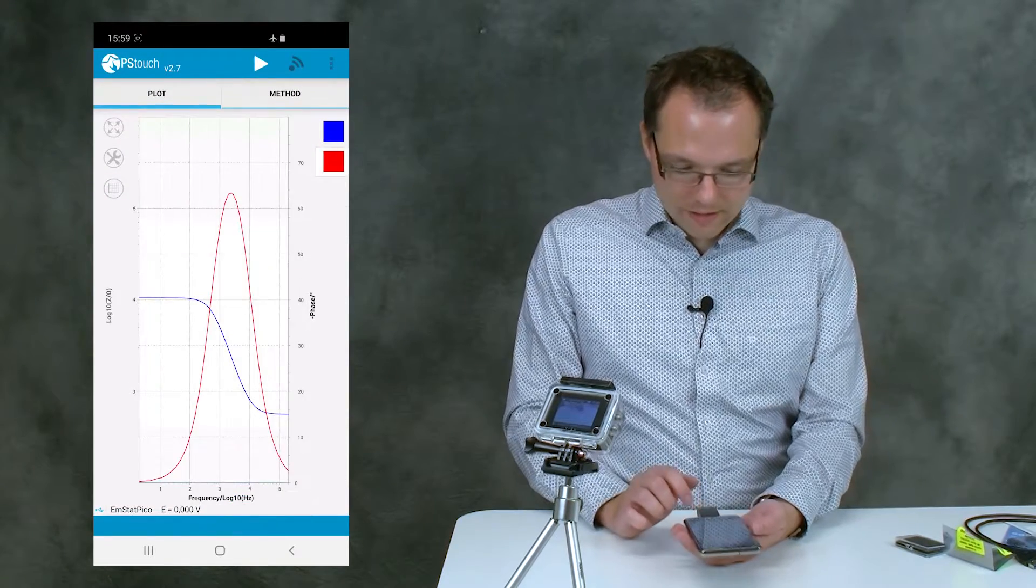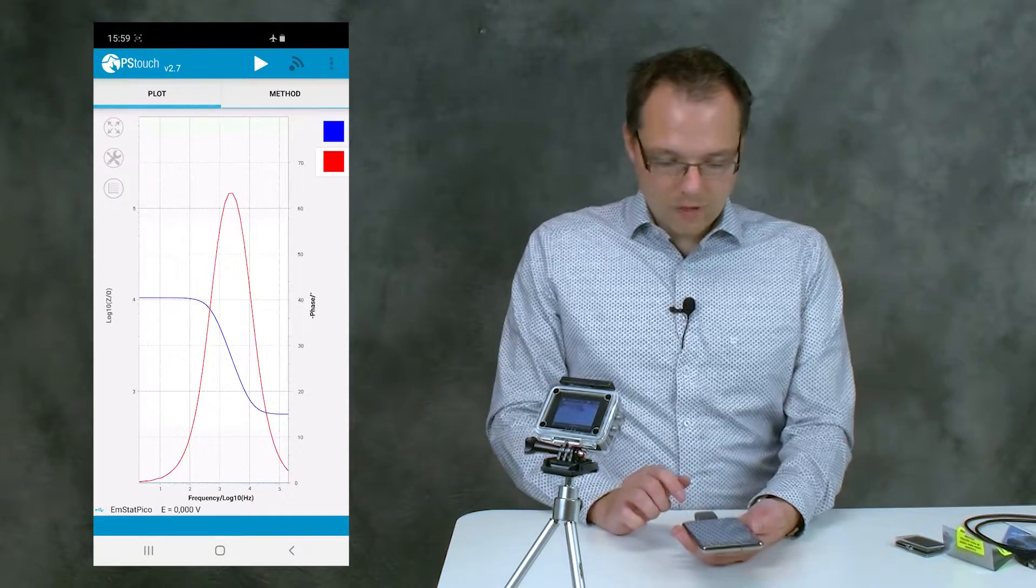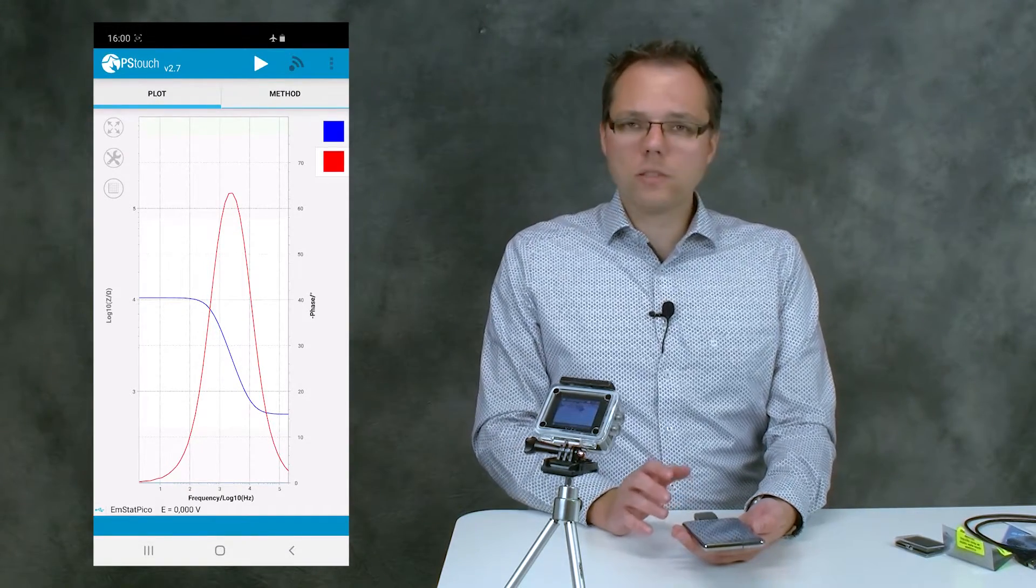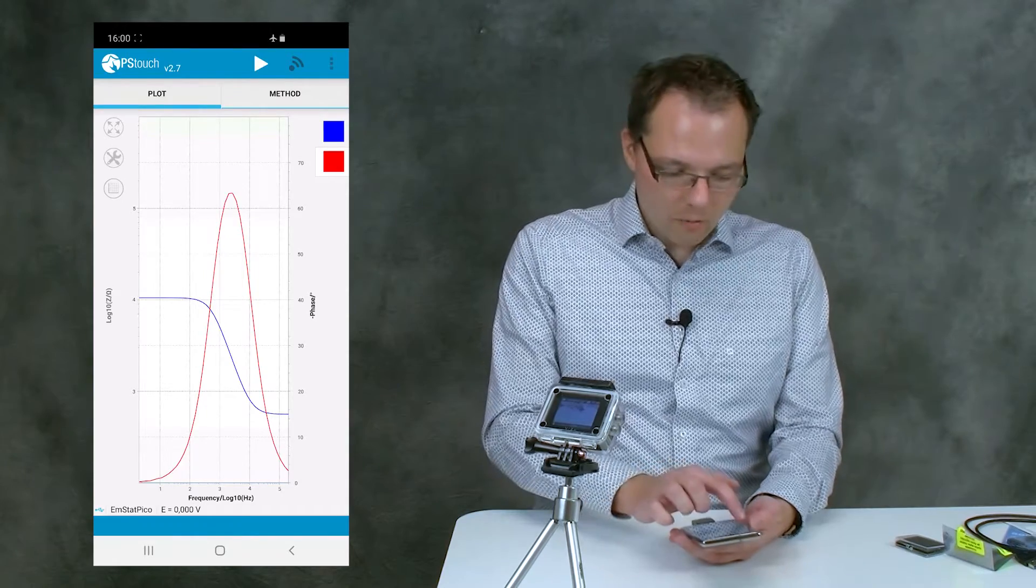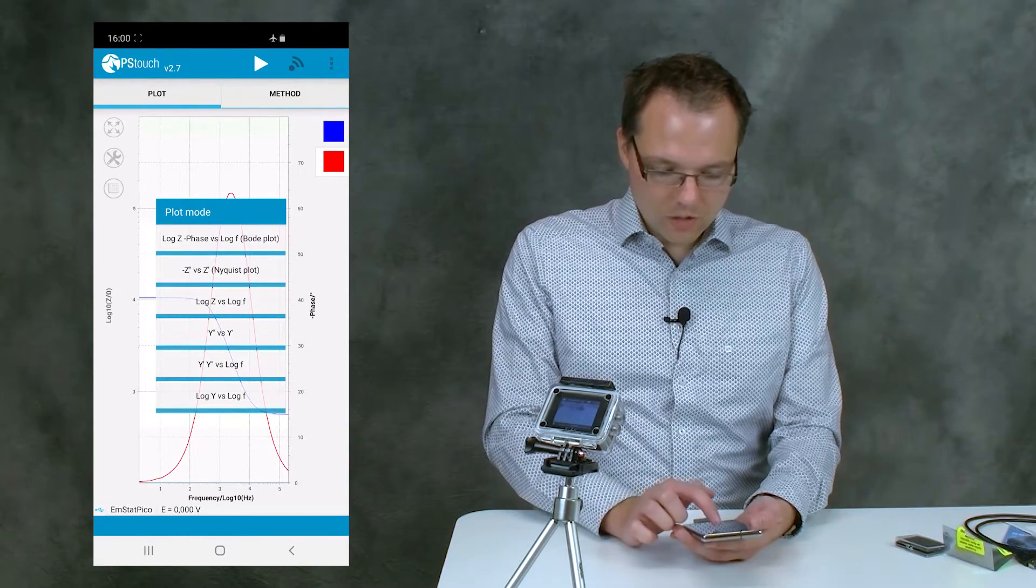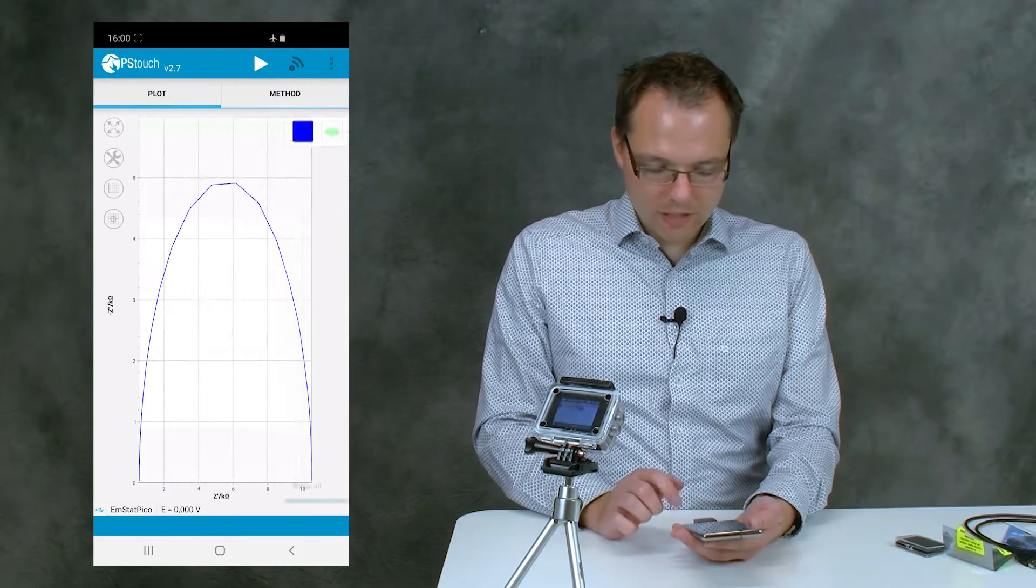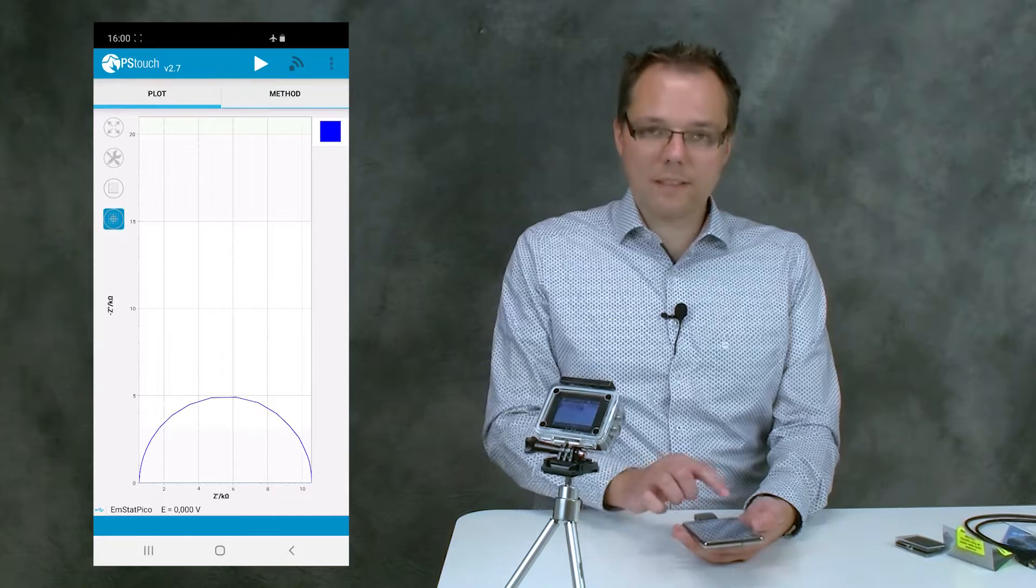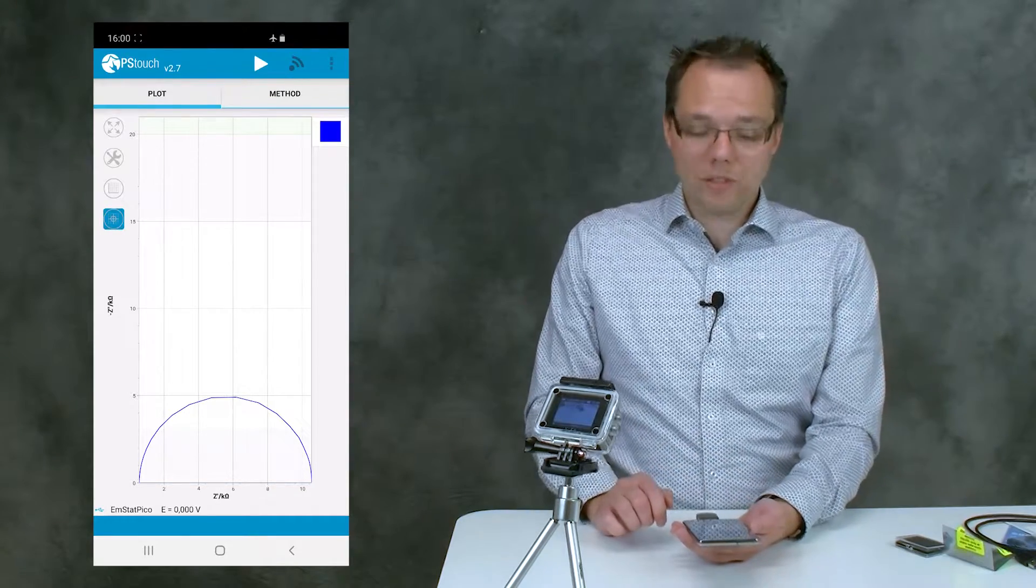So now you see that the measurement was loaded. For a few of you, it might be like, oh, this is a Bode plot. That's usually not what I'm using. Well, you can already switch that here to the Nyquist plot, and that's maybe something you're more used to. And if you press the equal axis scaling, then you see the semicircle that you're used to.